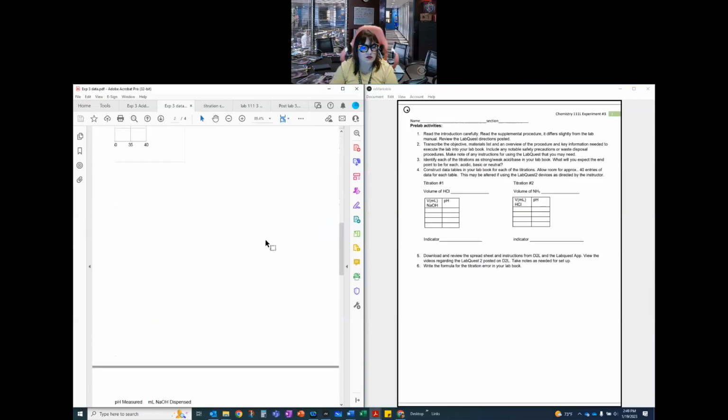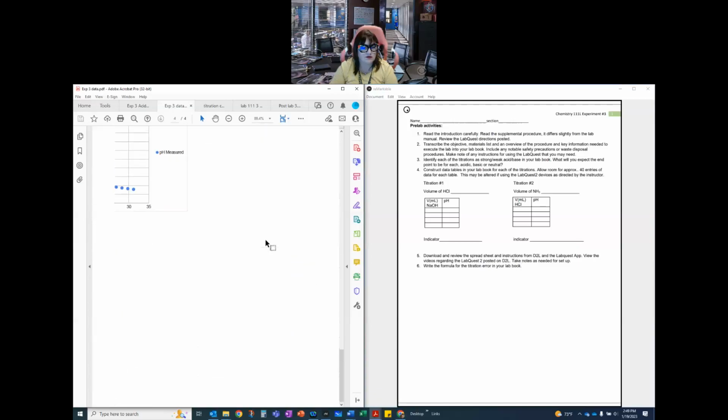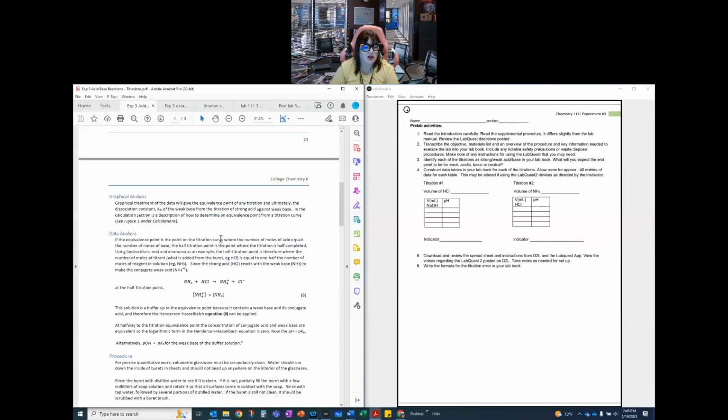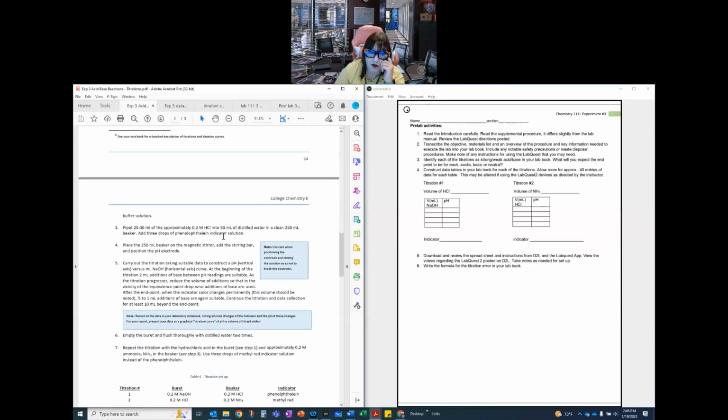That's a good question. So your volume of the material that you started with, we can assume that that's 25.00. Okay. It may not have been exactly that much.